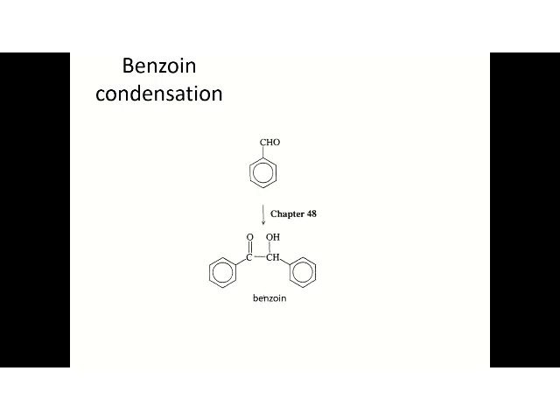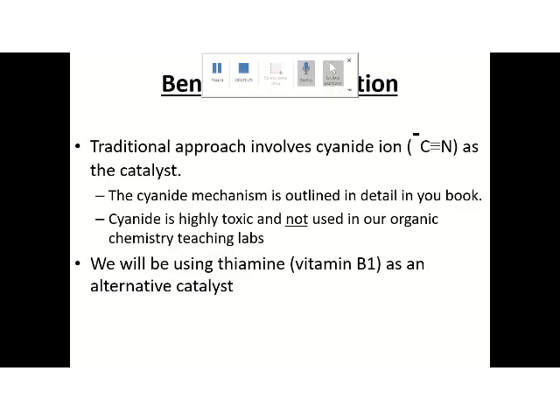As you may know, this is very important when you do your calculations and use the stoichiometry of the reaction. So make sure you understand and take into account this key aspect of the reaction.